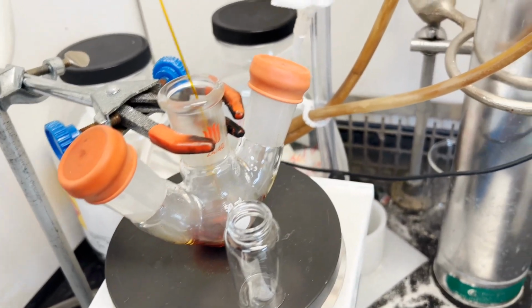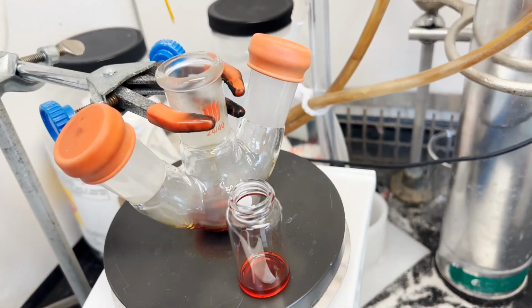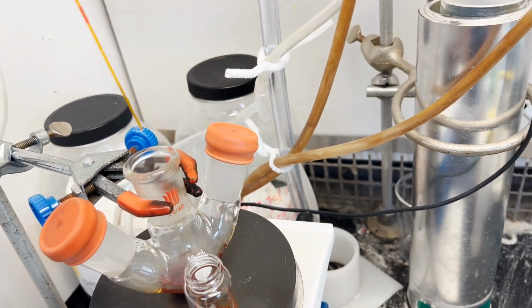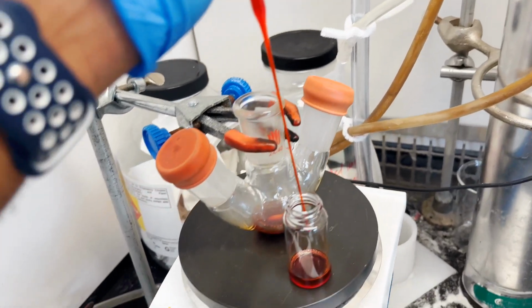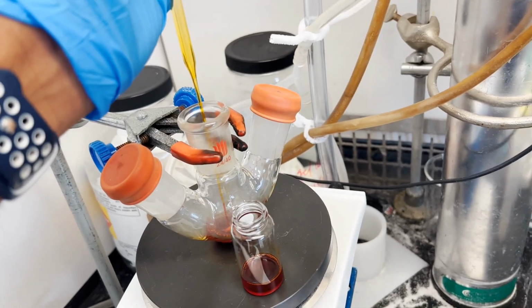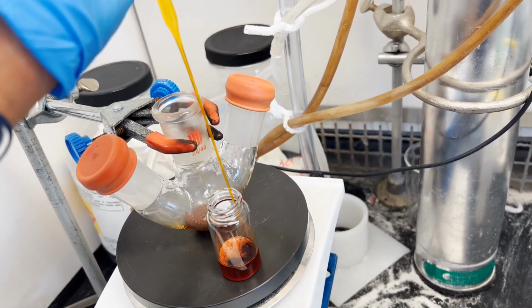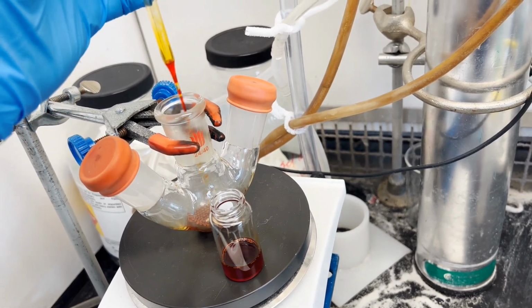Another thing, Schiff bases are normally colored compounds. Here you can see a very nicely colored solution. Even if both starting materials are colorless, you might still see a colored compound, because Schiff bases normally give colored compounds. So here I'm transferring this solution into a vial. Once it is done, then I'll do the rotovap.